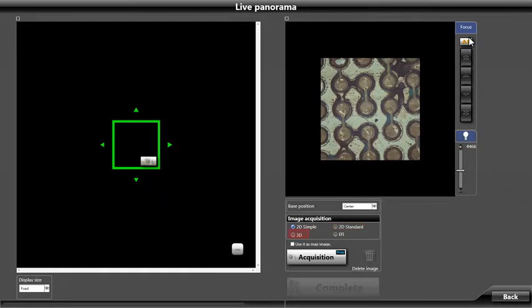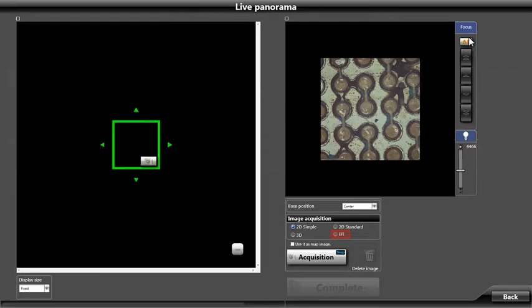3D allows us to create panoramic images that are stitched in multiple focus planes to allow for 3D rendering of the entire panoramic image. This function requires the 3D option. EFI allows us to create a panoramic image that is stitched in multiple focus planes to produce an all-in-focus panoramic image.